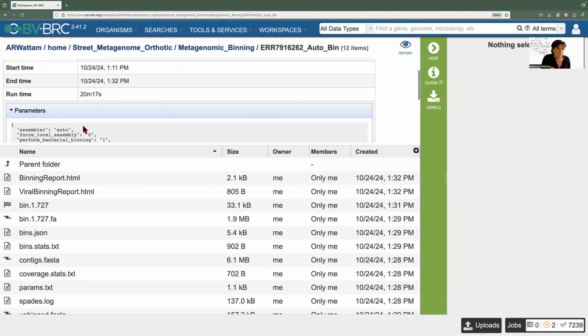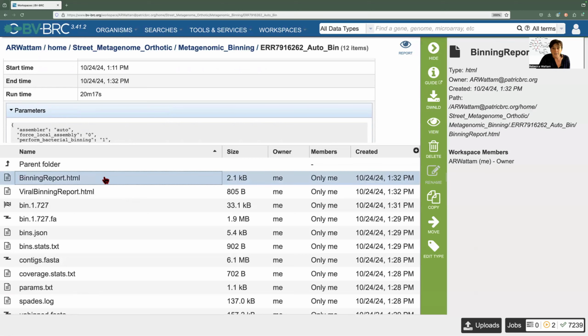In this particular video, we're just going to go over the bacterial binning report, and then we'll do a separate one for the viral binning report, and then we'll go into all of this other stuff. So I'm going to break it up because there's a lot of information here. So bacterial binning report. So we click on that.